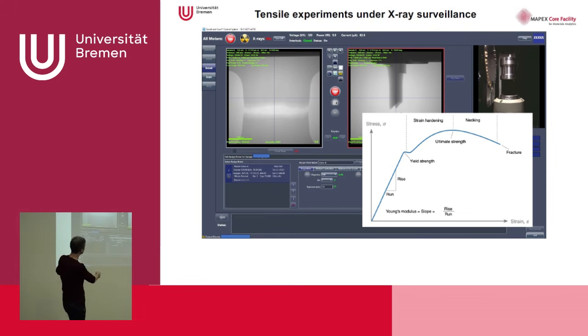And this kind of breakage is very rough, and they have different alloys that break really differently. So that was interesting for those guys because they want to characterize the stability of their alloys in terms of mechanical stress. And this is what you can do also with this kind of special mounting technique. We can place your samples in the beam, make some mechanical testing, and then you compare the stages of these kinds of experiments.